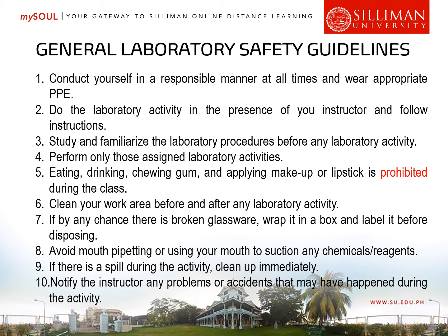And number 10, notify the instructor any problems or accidents that may have happened during the activity. So this is also very important that you need to address the situation immediately. And one way of doing that is to inform your teacher or your head medical technologist that an accident happened so that it can be properly documented.